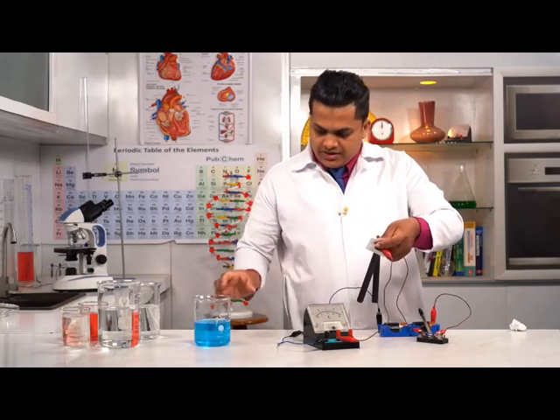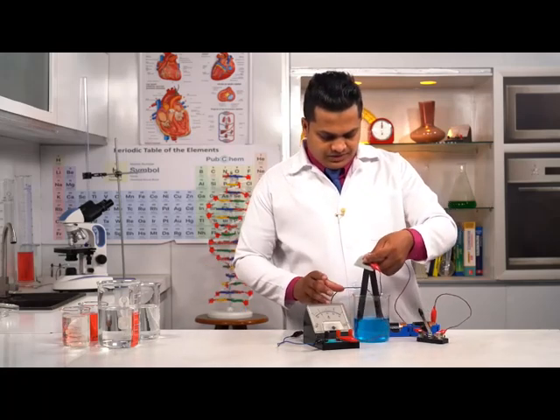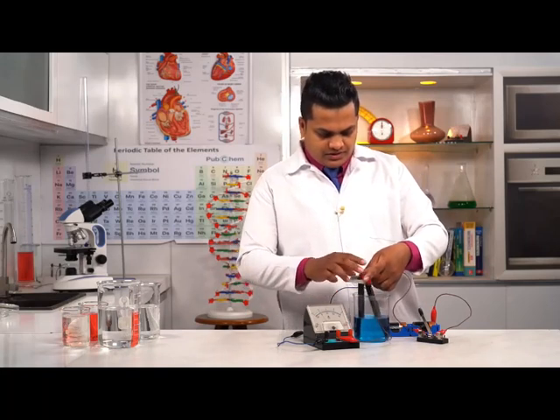Now let's take the copper sulfate solution. Dip it carefully.